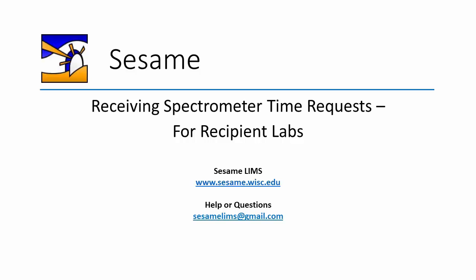Hello and welcome to this video tutorial for Recipient Labs about receiving and processing time requests for NMR spectrometers in Sesame. Sesame's time request view is used to manage requests for time on spectrometer equipment.